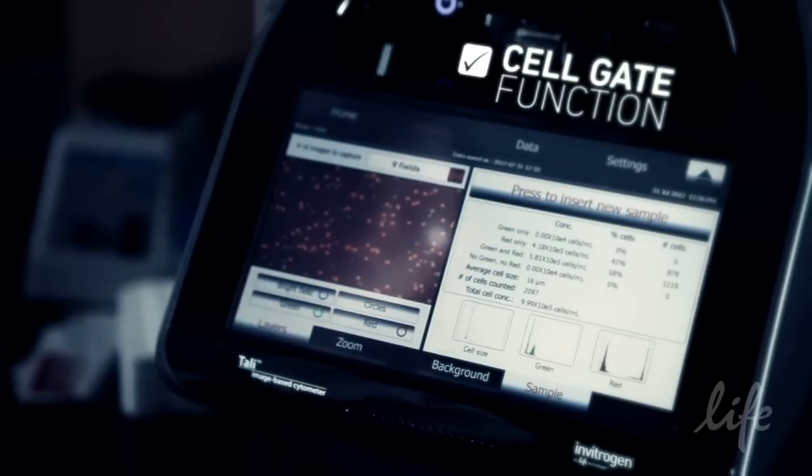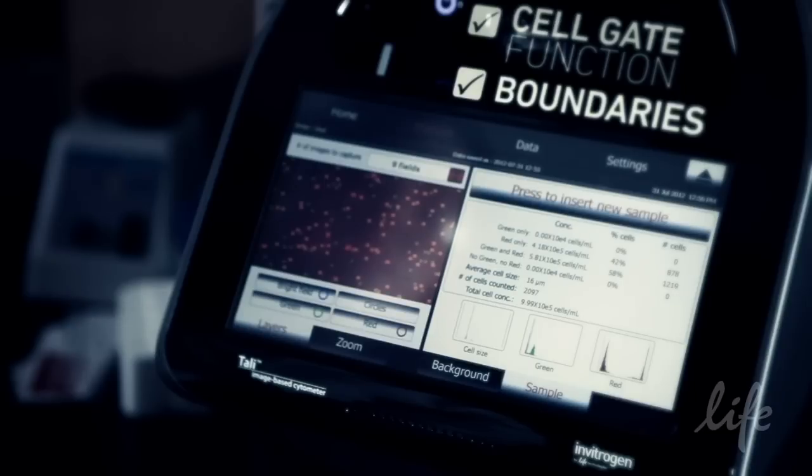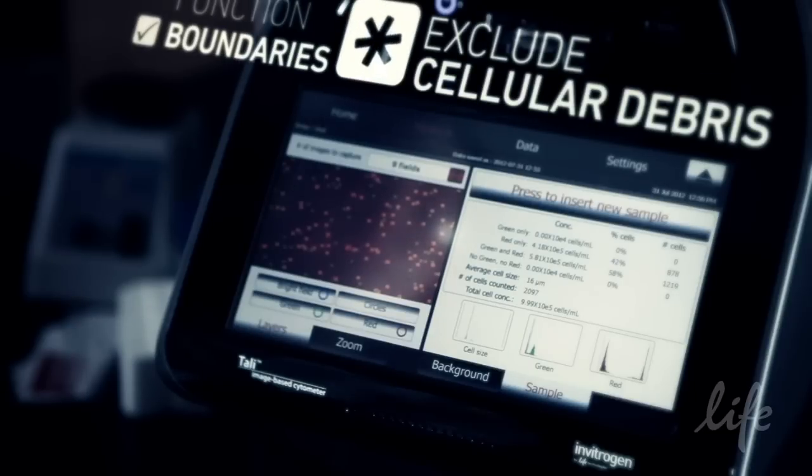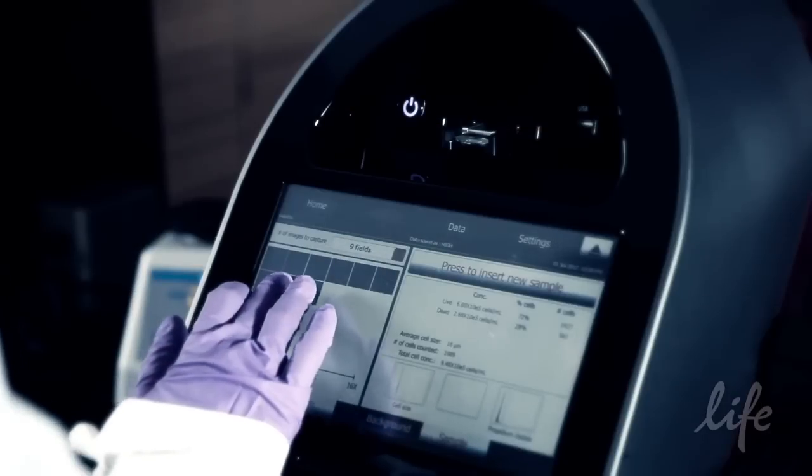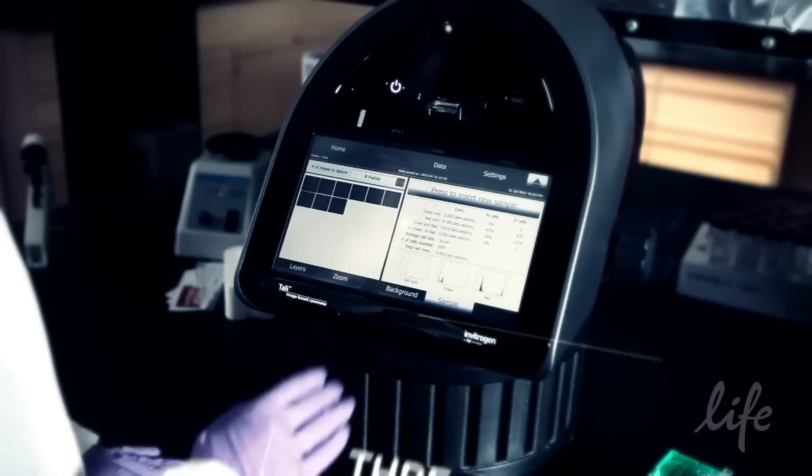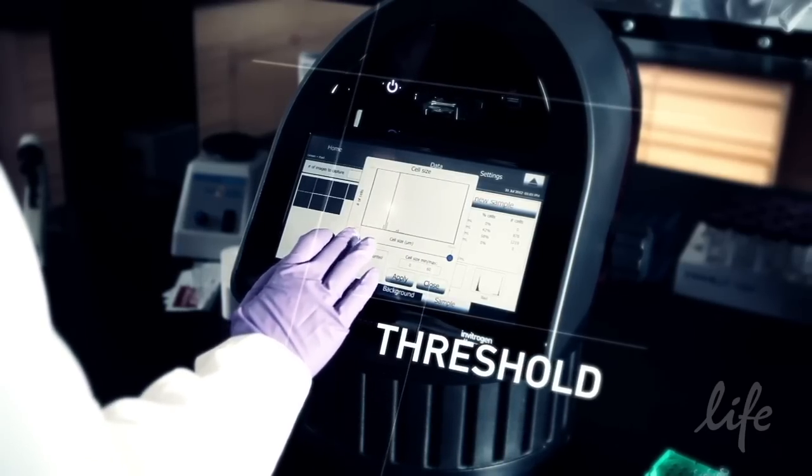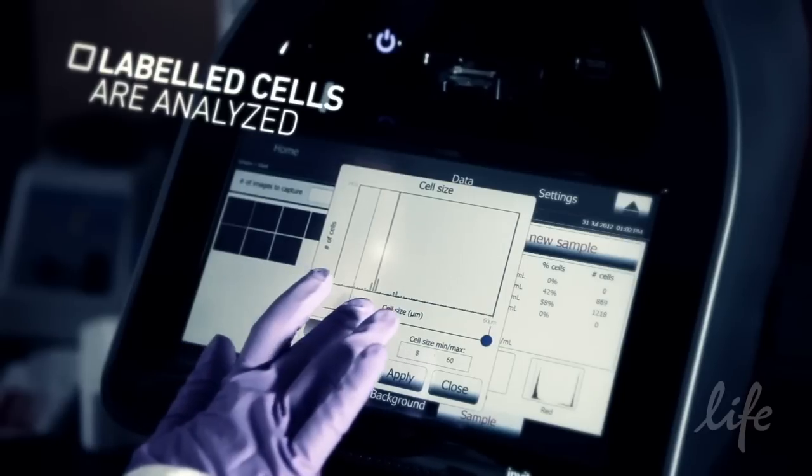Using the cell gate function, boundaries for cell size can be established to exclude cellular debris from the count. In addition, the fluorescence detection threshold can be set based on an unstained control to ensure only labeled cells are analyzed.